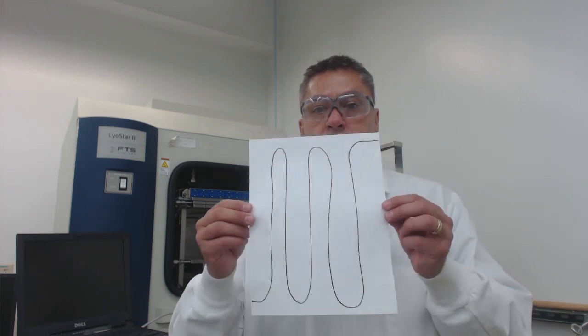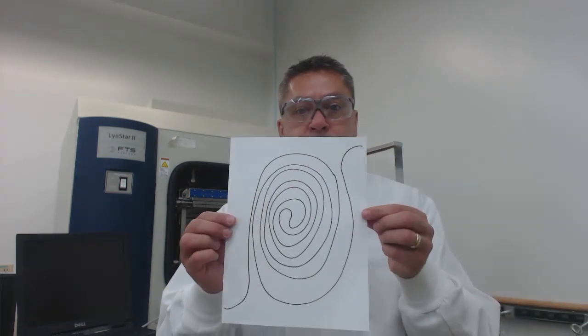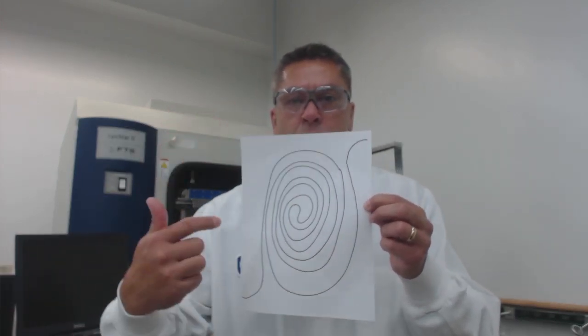Something else that we need to discuss is how do we cool these vials? Where does this cold temperature come from? Well, these shelves are hollow. They have a cooling fluid or heat transfer fluid that rotates and flows through them. Something else that is different between different lyophilizers is how that fluid flows. On some shelves, it flows in a serpentine pattern, up and down. Other shelves, it will flow in a spiral pattern.